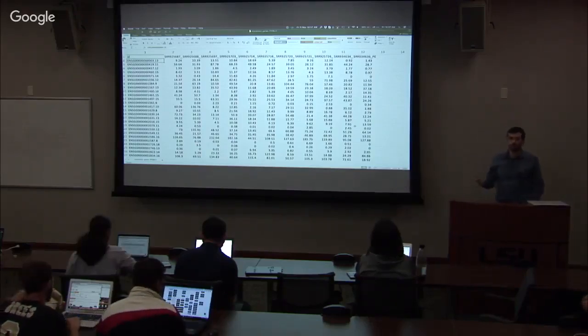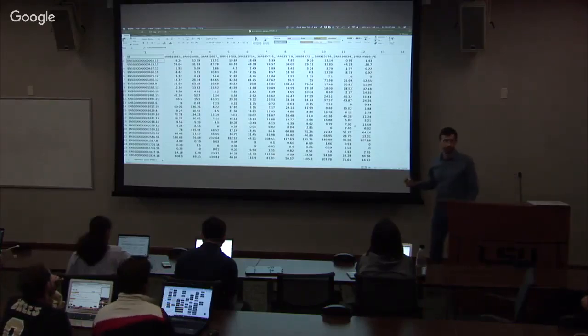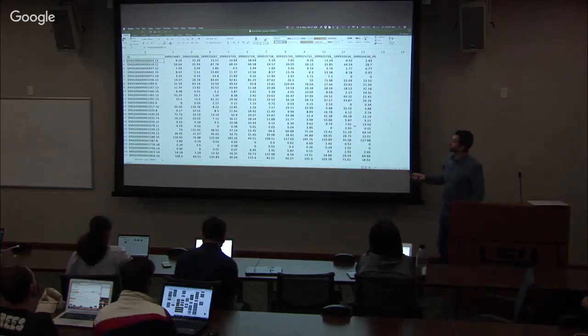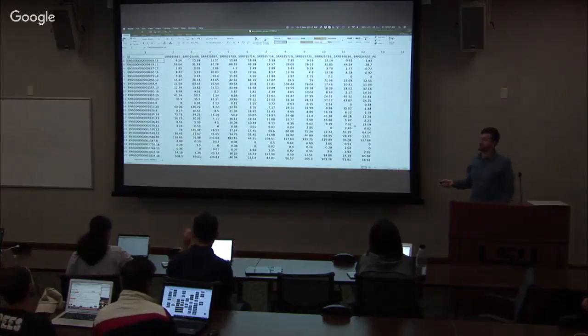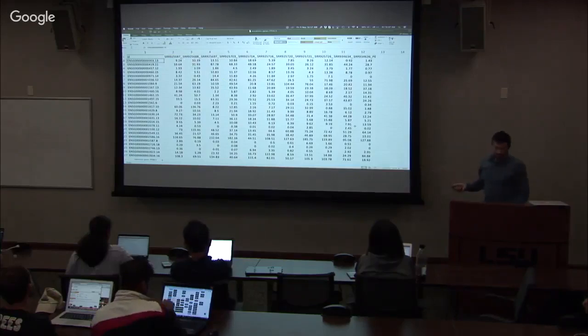Okay, so what are we seeing here in this table? As you remember in that visual representation of the gene signature panel, PAM50, the columns are going to be your samples. The rows are going to be genes. So this is an Ensembl ID of a specific gene, ENSG. And what's inside is the level of expression.